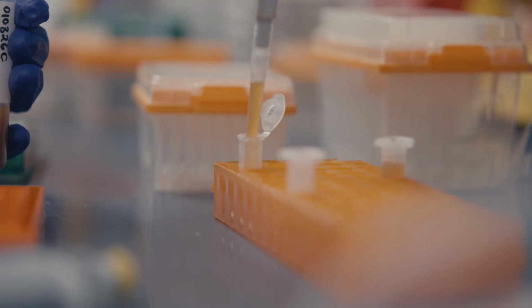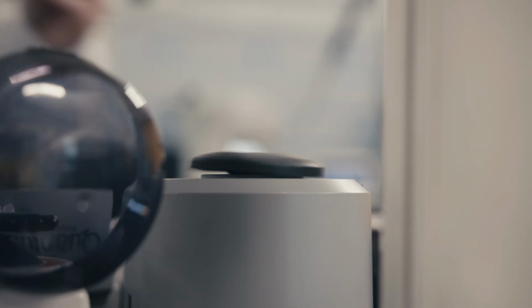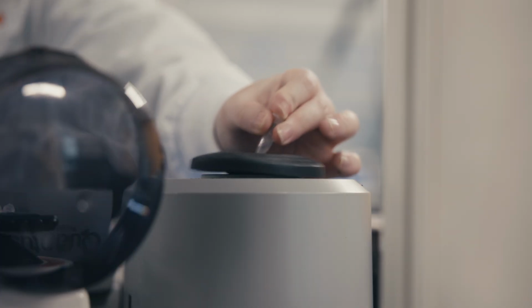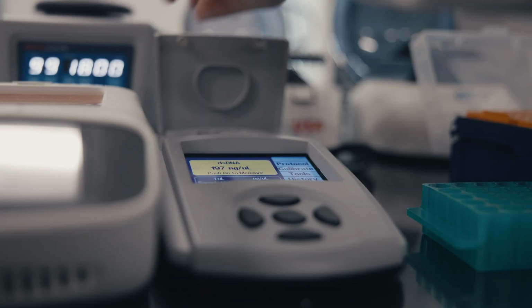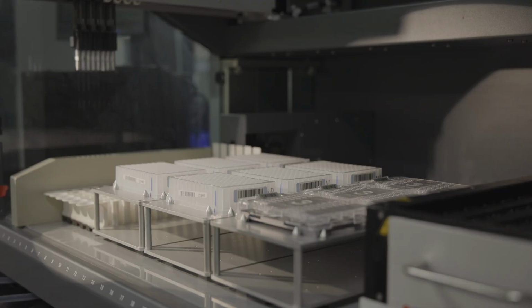Those processes will end up denaturing the DNA. It takes those two strands and unravels it, and then we add the A, C, G, and T, those 4 building blocks of the DNA. We take those and use our primers, and we add that to the denatured DNA to help build out those structures. And what we're trying to visualize is actually the underlying genome that sits on that animal.